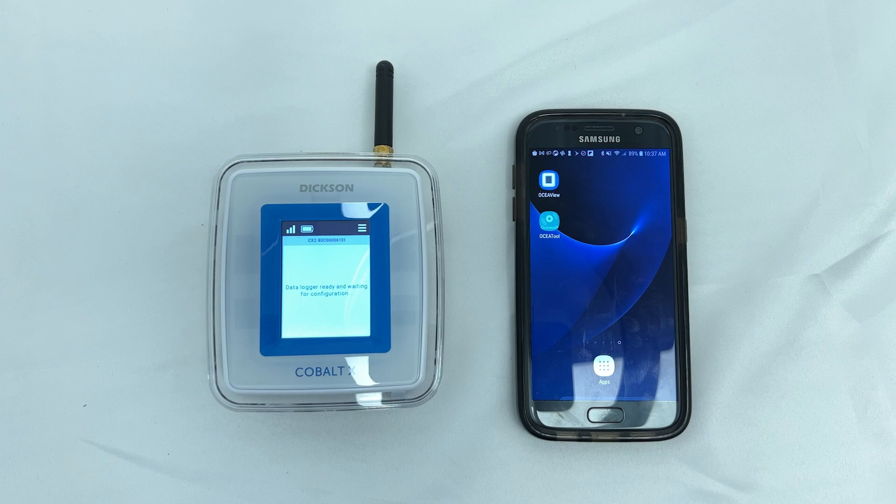The OCEAView mobile app is required to update the firmware. It can be downloaded from the App Store or Play Store.